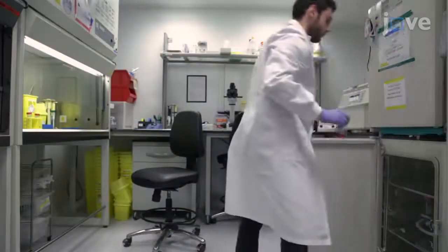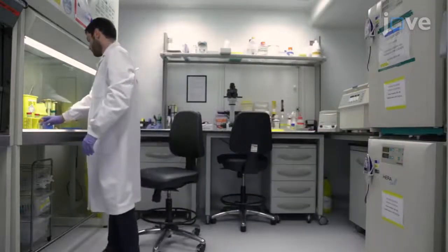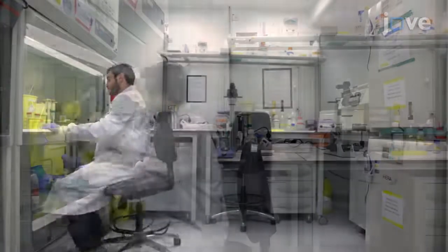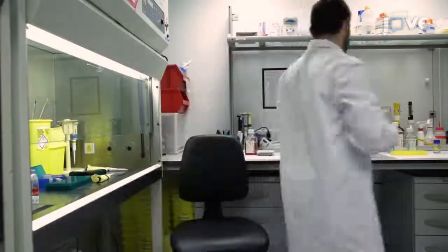Culture THP1 cells in R10 medium at 37 degrees Celsius with 5% carbon dioxide. Every 3 days, adjust the cell density to 300,000 cells per milliliter.